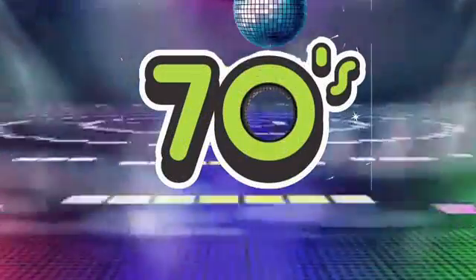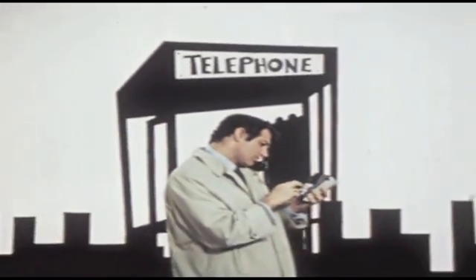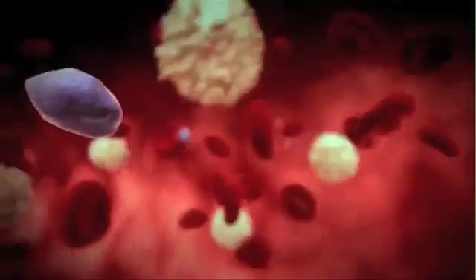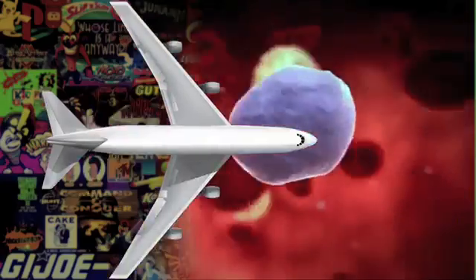The 1970s. In the 1970s, the release of the pocket calculator helped us attain more accurate math calculations. The development of flotation sedimentation techniques opened up capabilities to study low-density molecules such as detergents and lipoproteins.